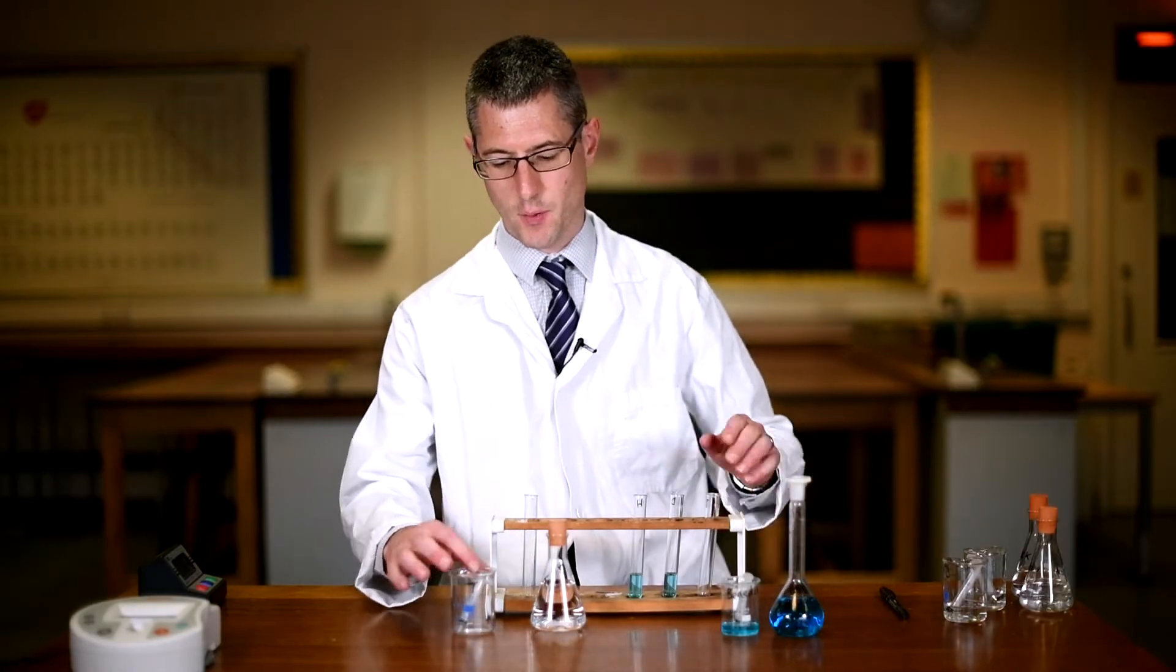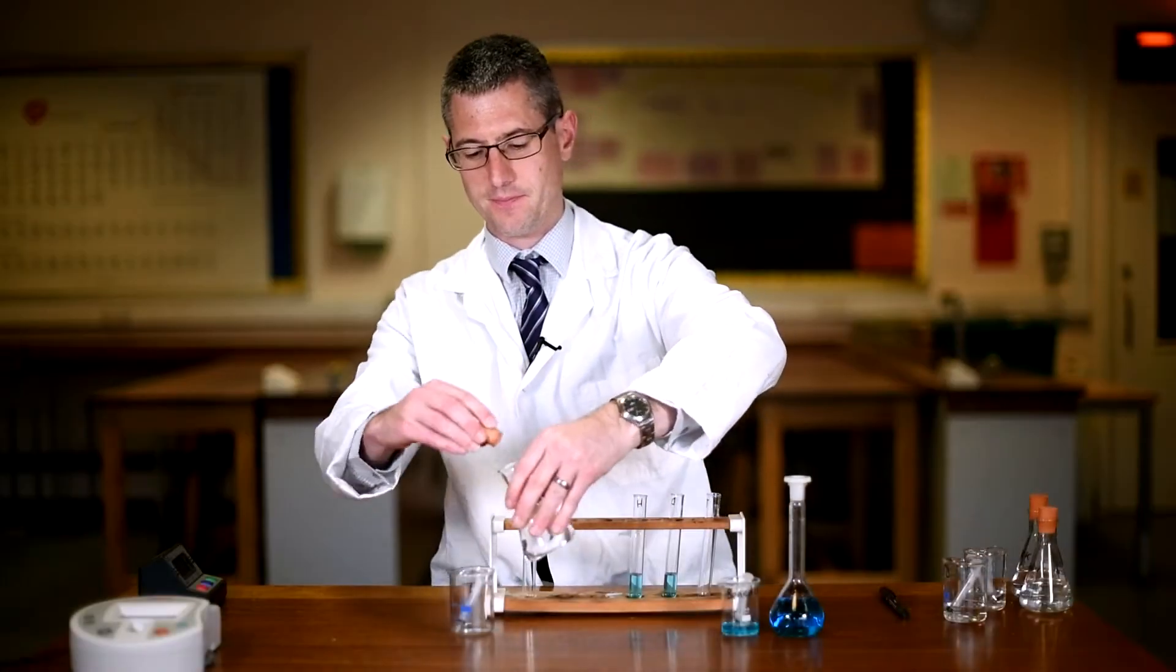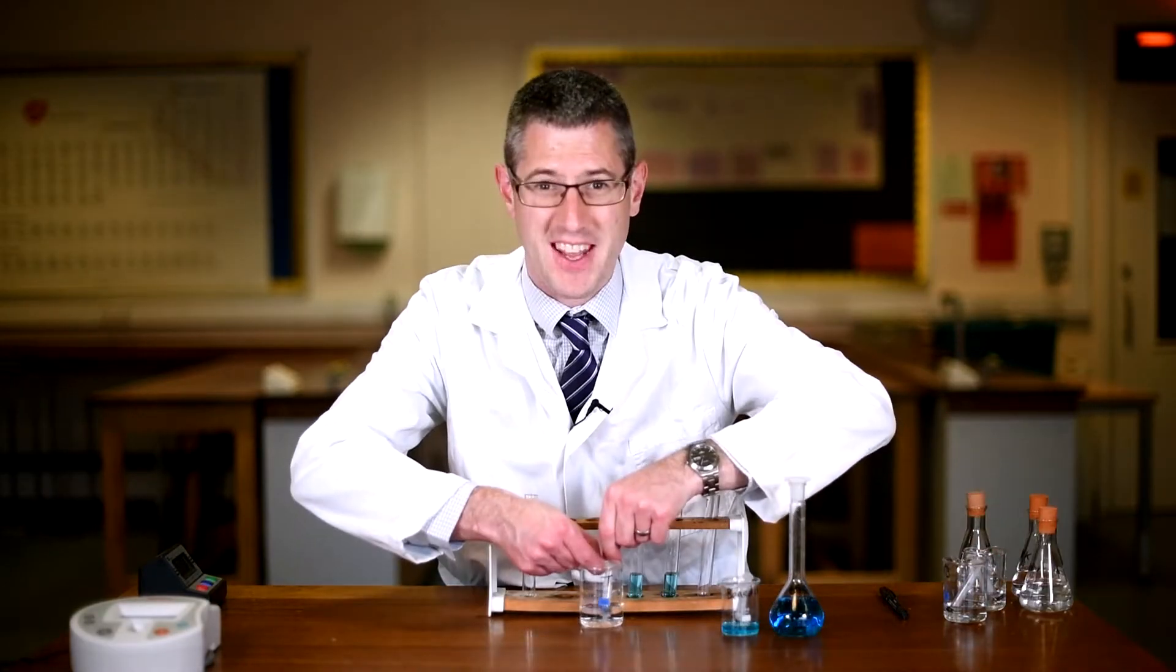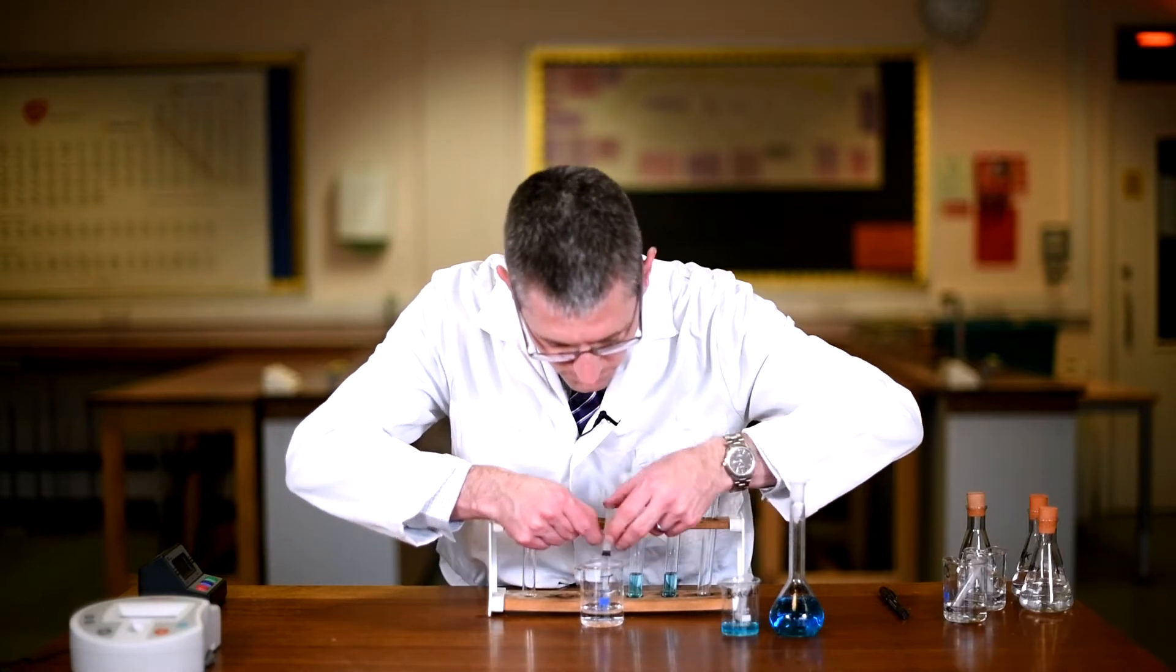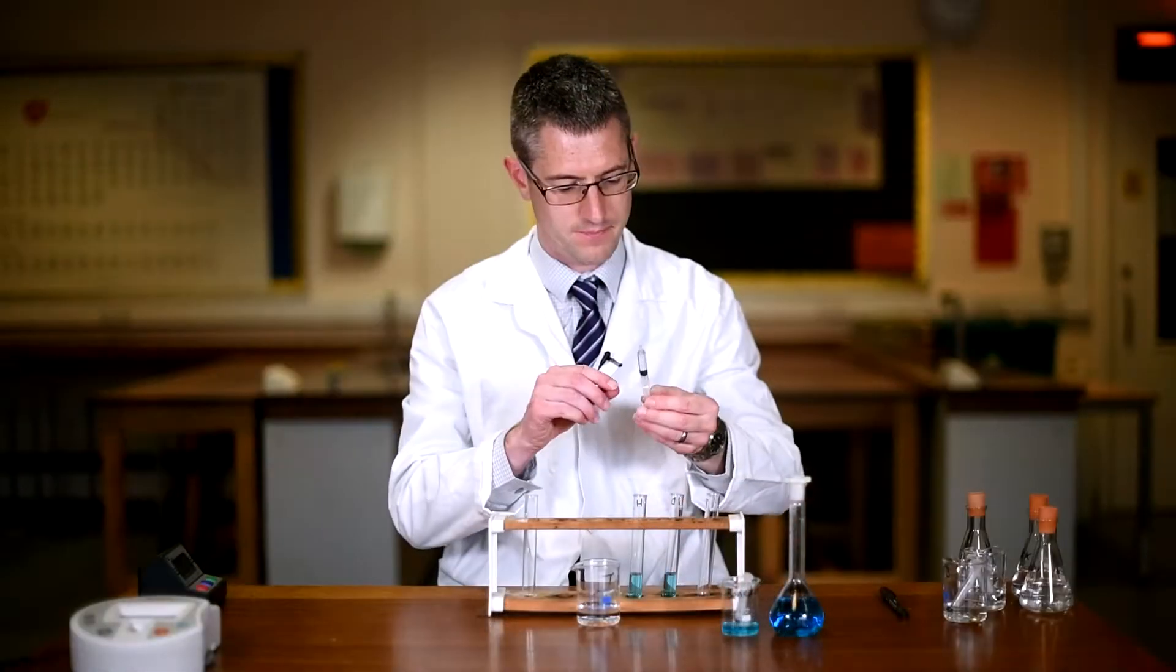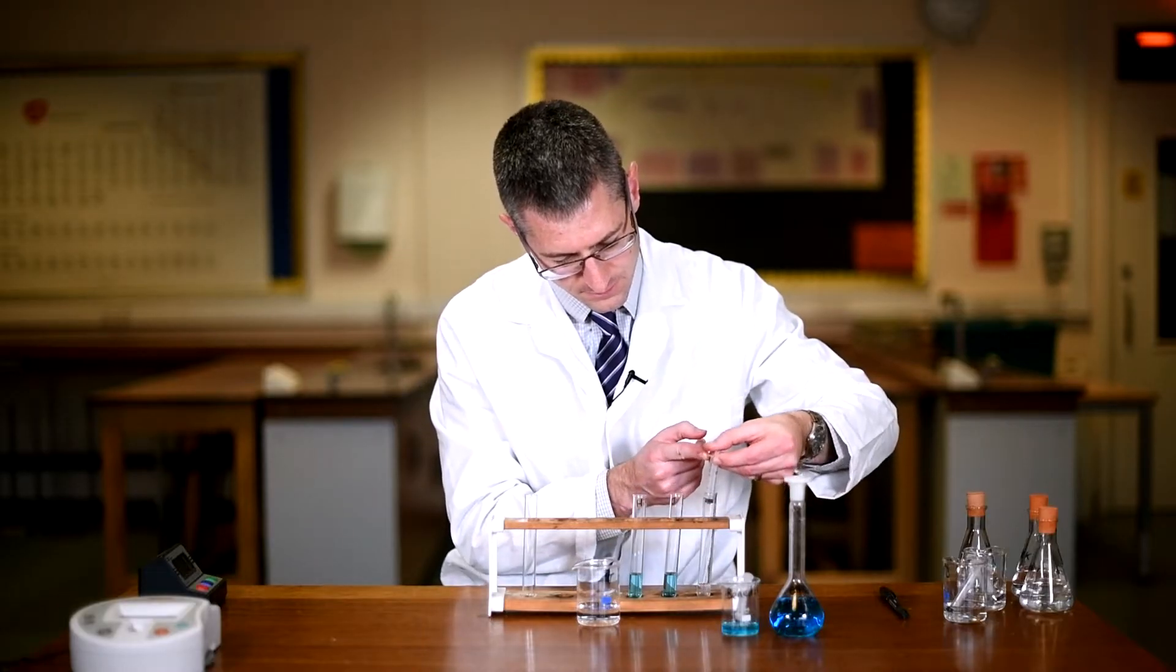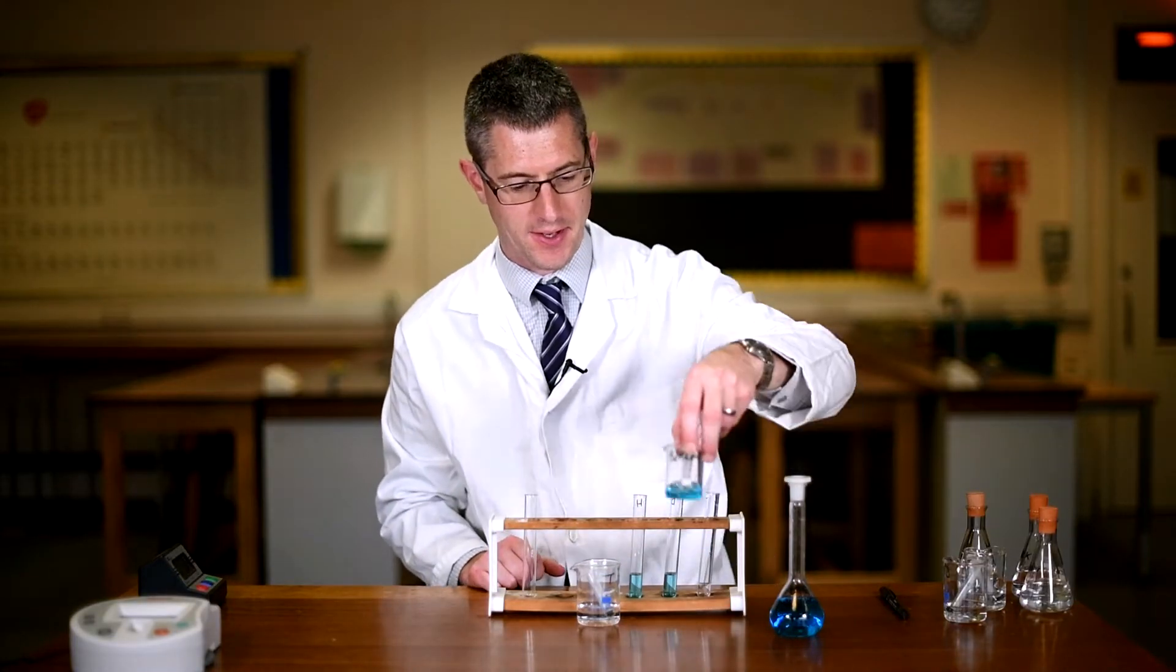So we need to give this a good shake, make sure it's fully suspended. Decant some of our urine into a beaker. Measure out carefully two milliliters of urine, checking it is an accurate two milliliter measurement into a test tube, carefully labeled with the letter T for Tom. Then add an equal volume of quantitative Benedict's.